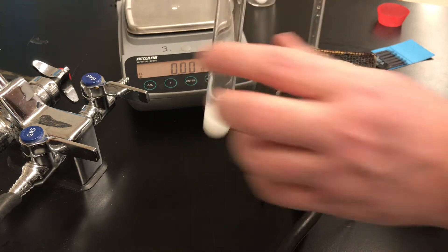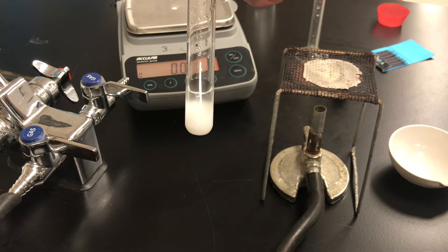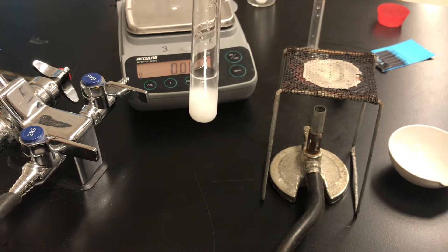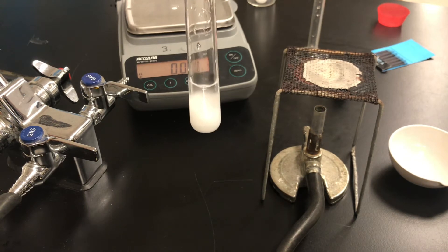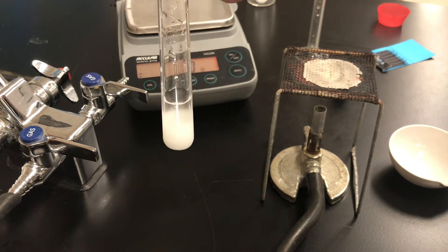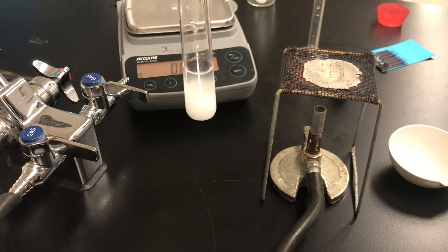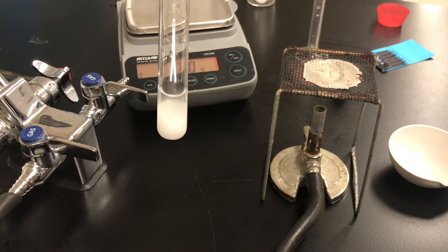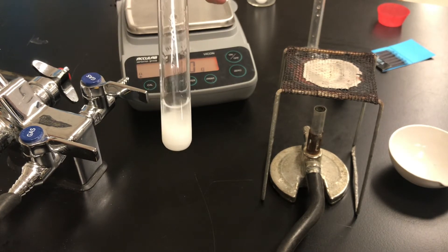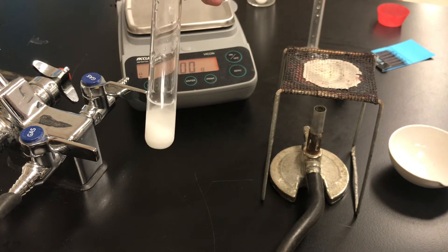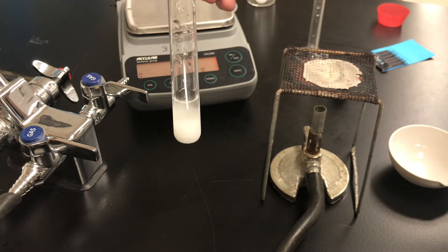At this point what we have is a mixture of table salt, sodium chloride and water. Some of the salt is dissolving into the water and we have a heterogeneous mixture as a result. It's heterogeneous because the concentration of the dissolved salt is higher at the bottom where the salt is than it would be at the top of the water. When you have different concentrations throughout the liquid you have what's referred to as a heterogeneous mixture.